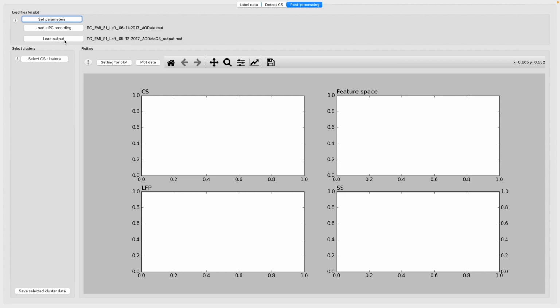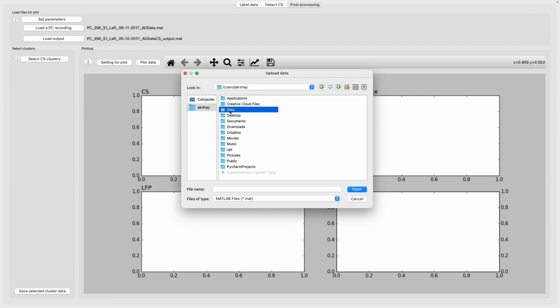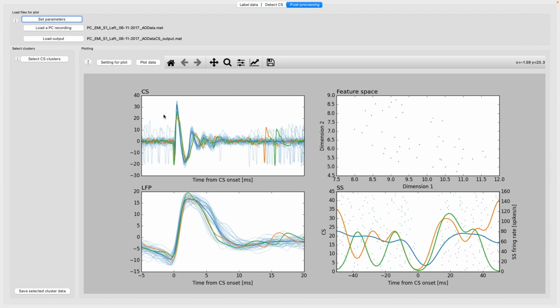and then I press the output, which should also match my output here. Let's go back to my data. Output 3, it was the second cell. So let's click this here, and I think this should plot the data, and there you go.